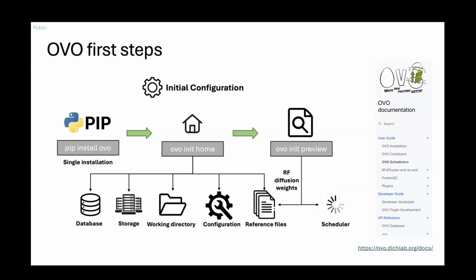So let's start with the first step. When you first encounter Ovo, of course, we encourage you to check the documentation at this link. We try to be very detailed there and explain as much as possible what the first steps are and what the features are.